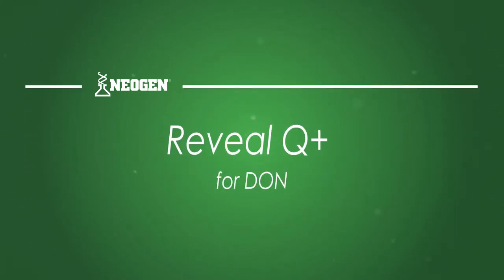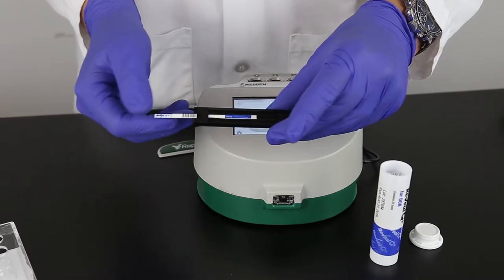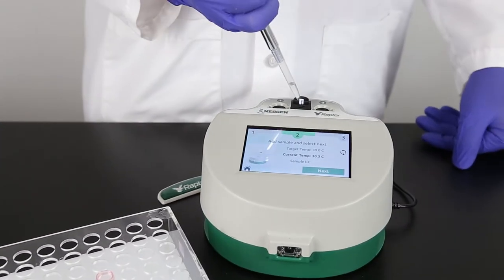In this video, we'll look at everything you need to know to run Reveal Q Plus for Dawn using the Raptor system. The Raptor system allows you to add sample and walk away. It's that simple.